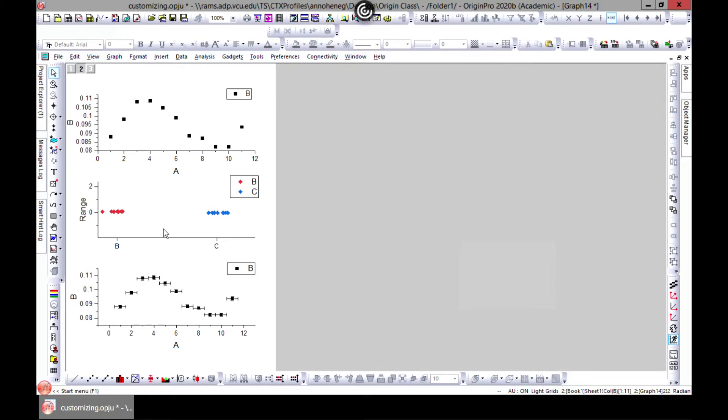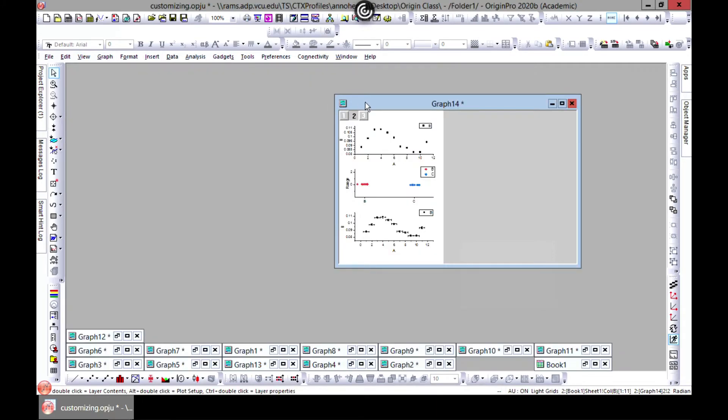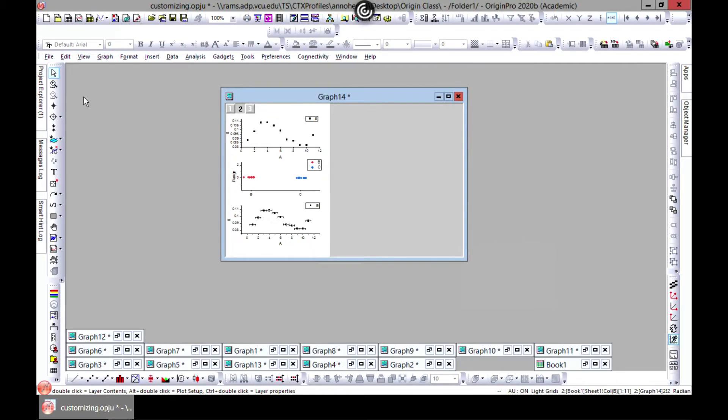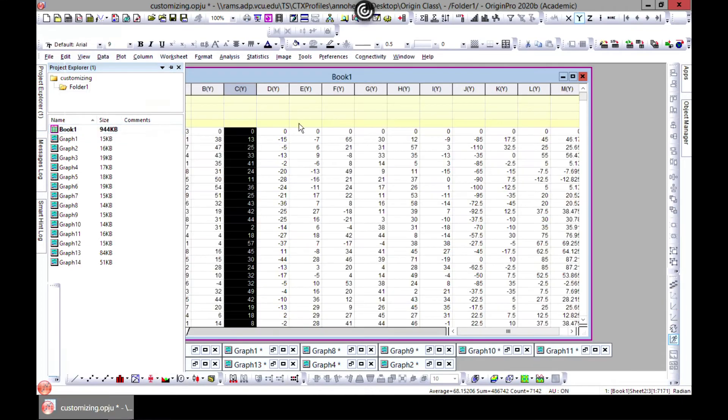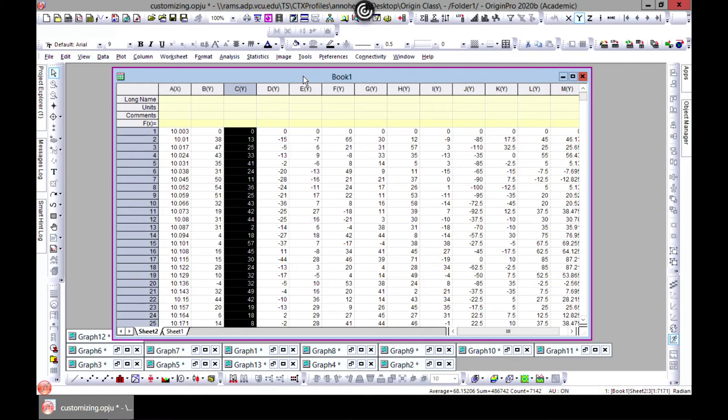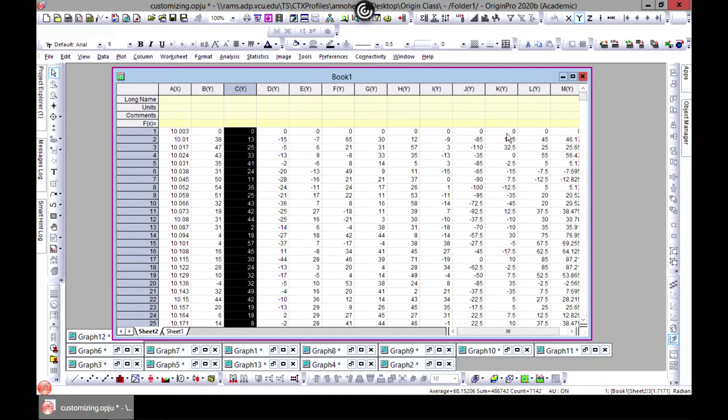Let's zoom out of this, come to Project Explorer, choose Book One, and then in Book One come to Sheet Two. You see this data which we saved as XRD before.